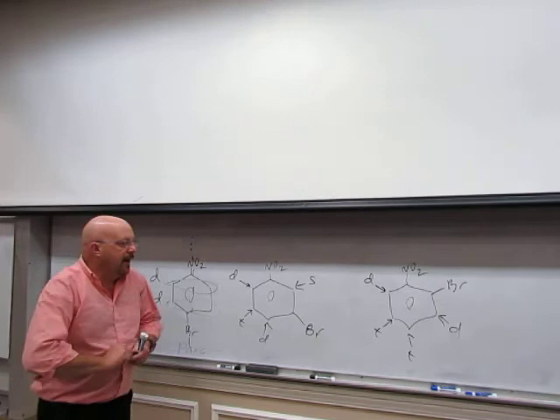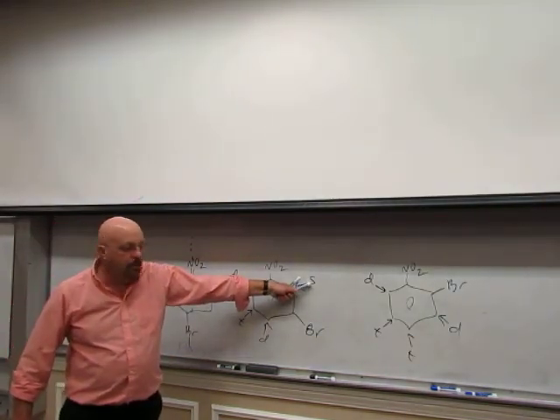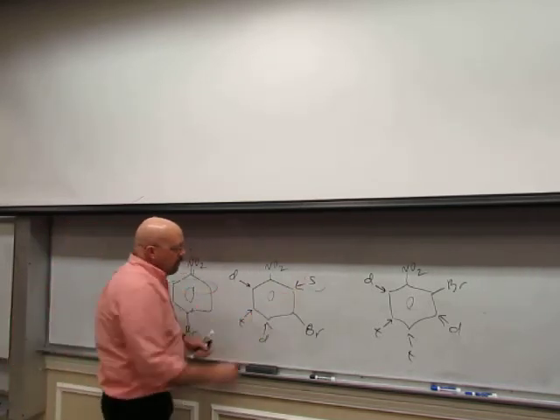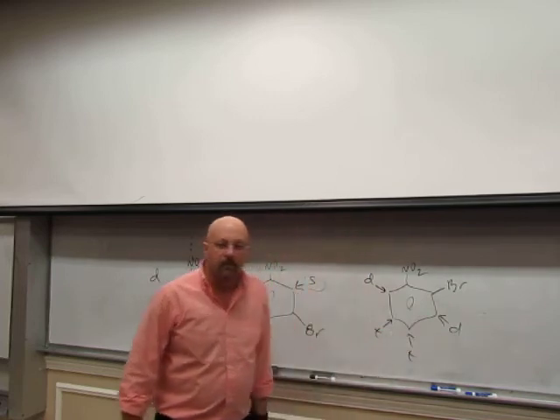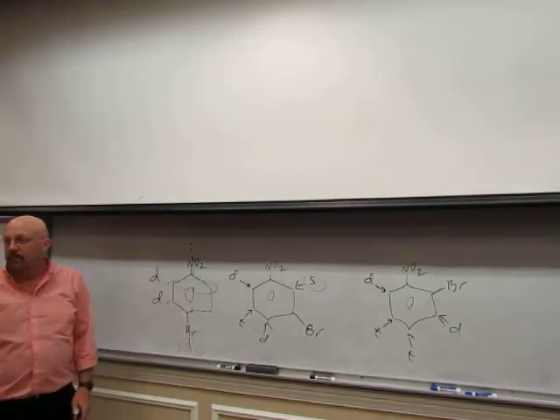So if you look down there at that aromatic region and you see a singlet showing up down there somewhere, along with these doublets and triplets and stuff, the singlet's what really stands out. You know it's the meta one, because the ortho one has two doublets and two triplets. Para only has two doublets.